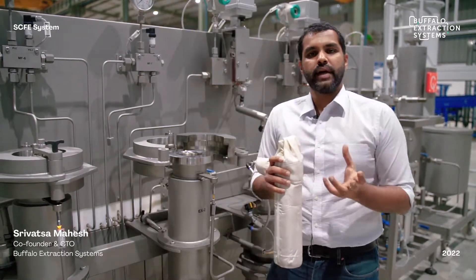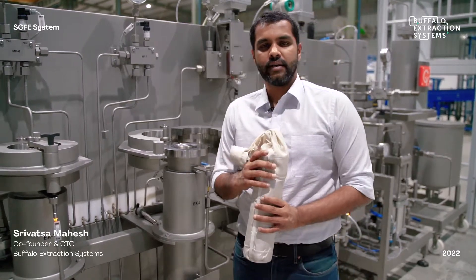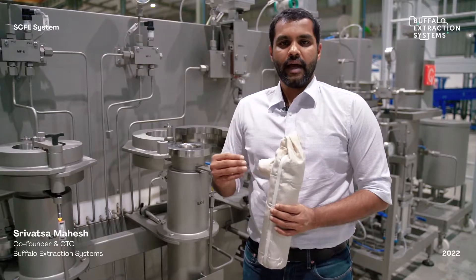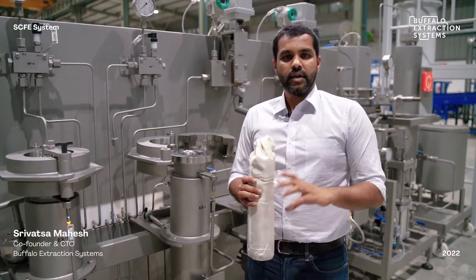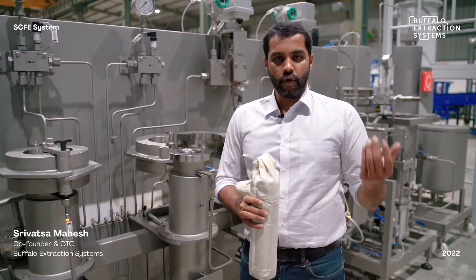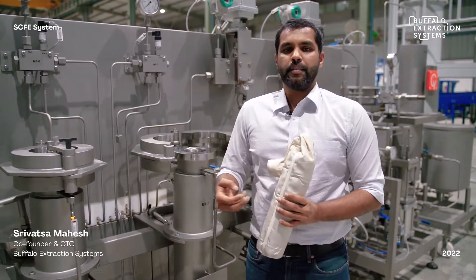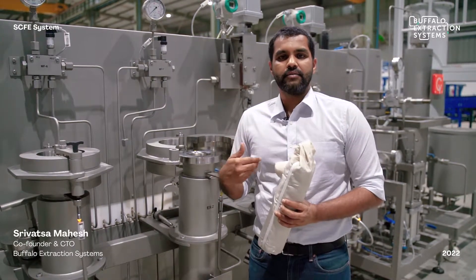The CO2 used during extraction is supercritical CO2 — it is at a pressure above 70 bar and a temperature above 31 degrees Celsius, during which it acts both as a liquid and a gas. Its liquid-like properties help carry the oils, while its gas-like properties allow it to diffuse into the material.